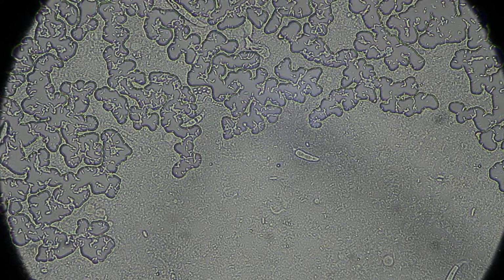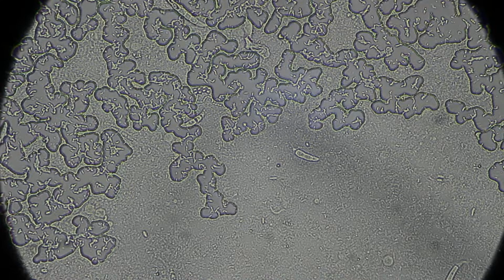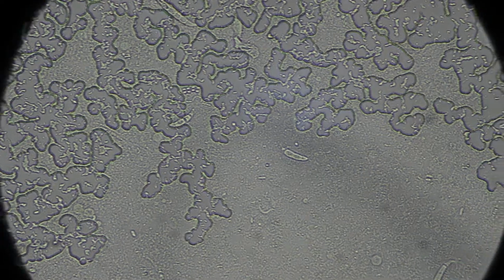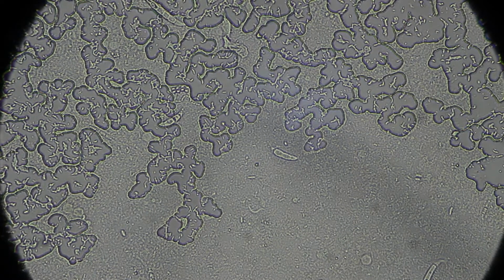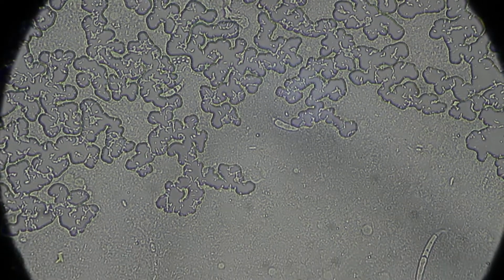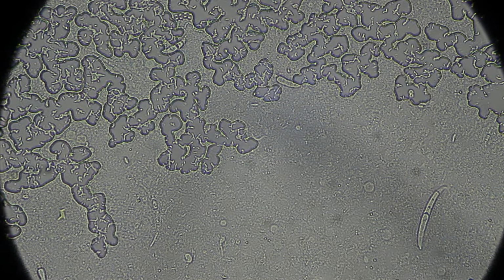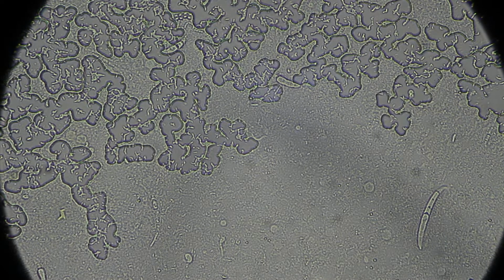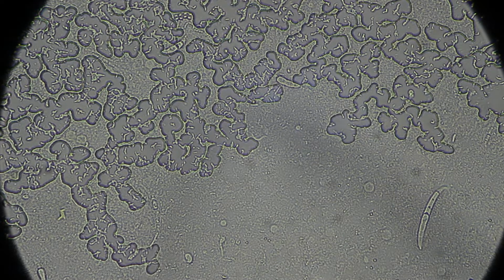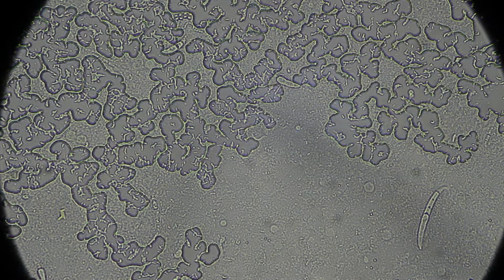You can see the rapid disappearing of water under the microscope. This, no doubt, is a disaster for all the bacteria and other microbes living in this small world. Air moves in fast, and the surface tension pushes microbes around like a flood. Some weaker microbes can be ripped apart simply by the force, while others dehydrate, waiting for their time to come.